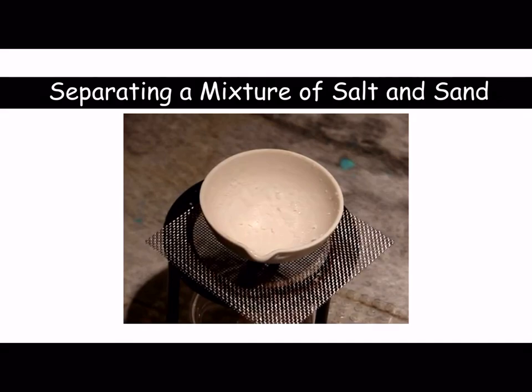So number one, we would make a solution by adding in the water. The water is to dissolve the salt, and we filter it through to remove the insoluble solid, which is the sand. And then we would undergo a process called evaporation to remove the water from the salt.